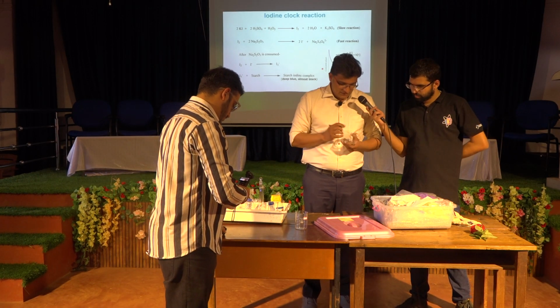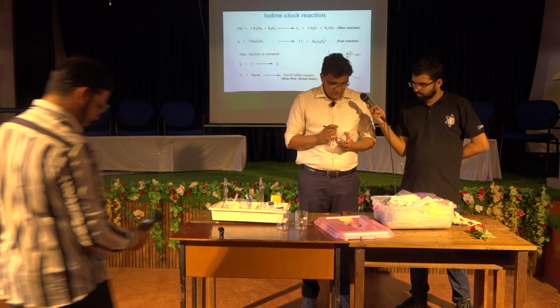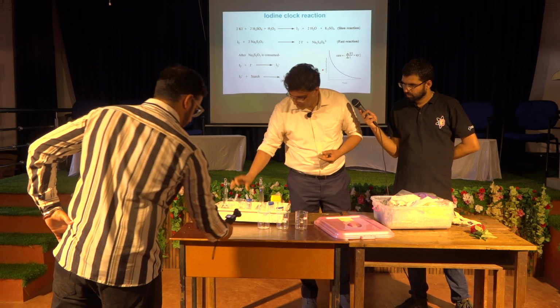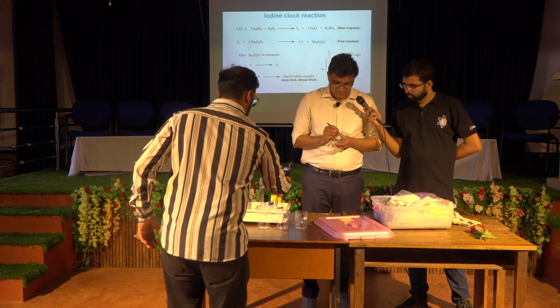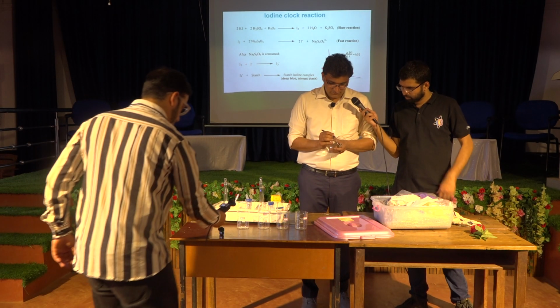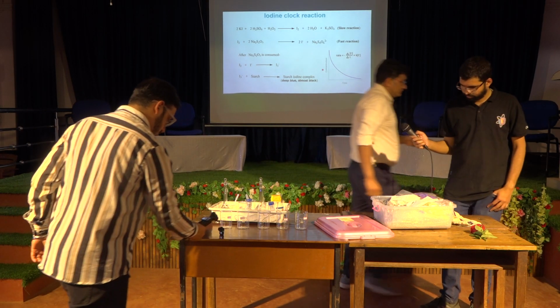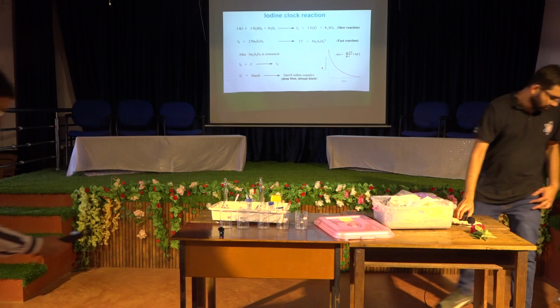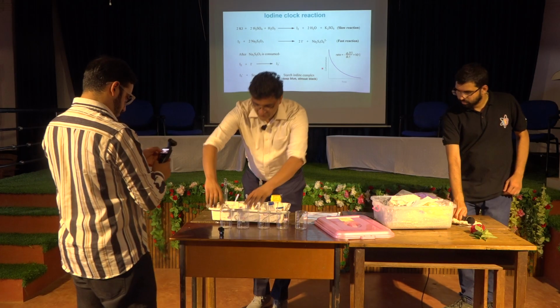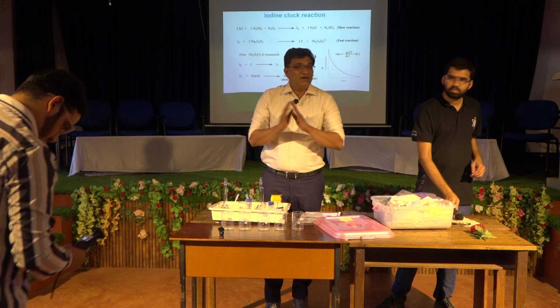I'm making them with different concentrations of iodine. In each beaker there will be 200 milliliters of solution at the end of the experiment.